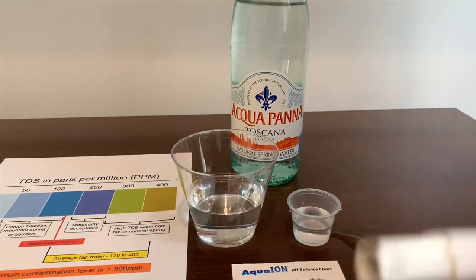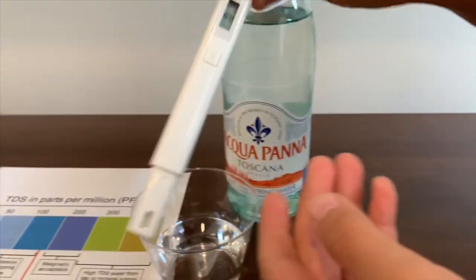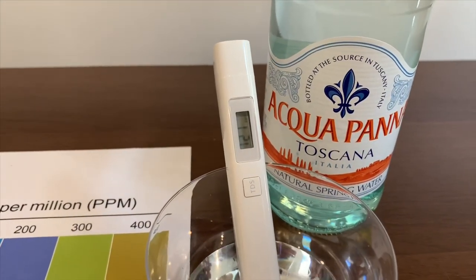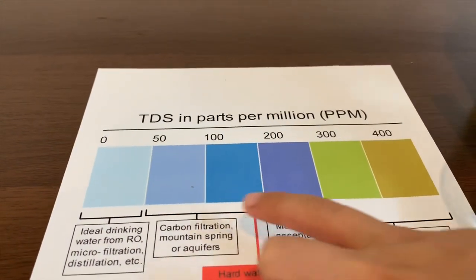First, we're going to test the TDS. Turn on the TDS tester, make sure it says zero, and put it in. It is 121. That means it is okay to drink.